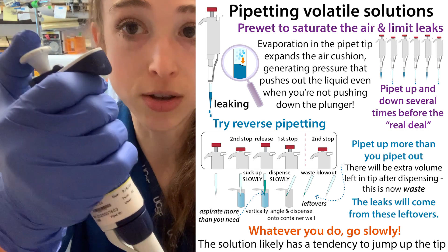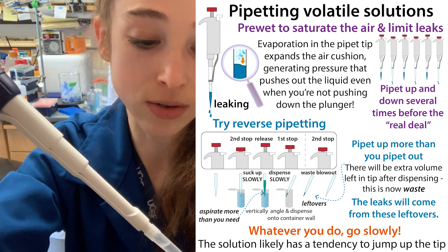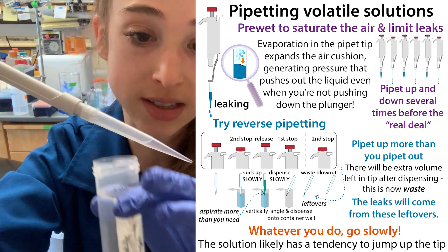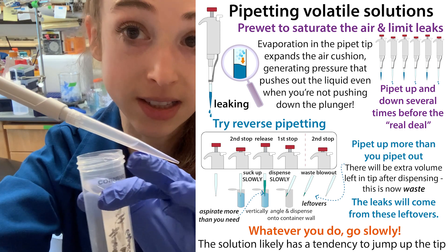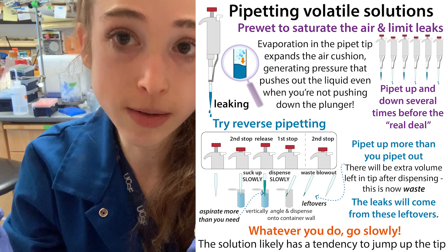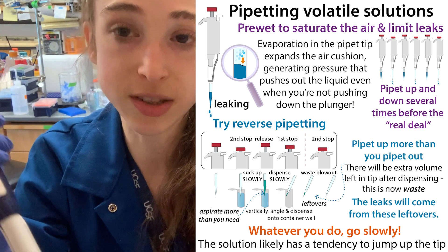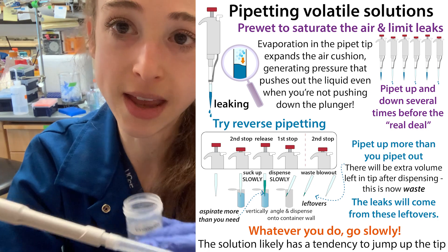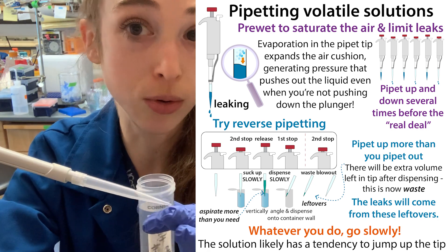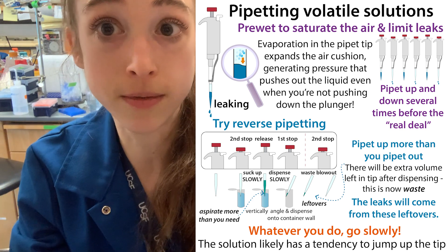With reverse pipetting, remember: go all the way down to the second stop, go in, pull out. When you dispense, only go to the first stop and leave the excess in the tip. Remember to pipette slowly both going in and going out — stay in control, don't let liquid splash back up into the pipette. And if it does, pull the liquid up slowly and use it to pull everything back down. Hope that helps you pipette volatile stuff.